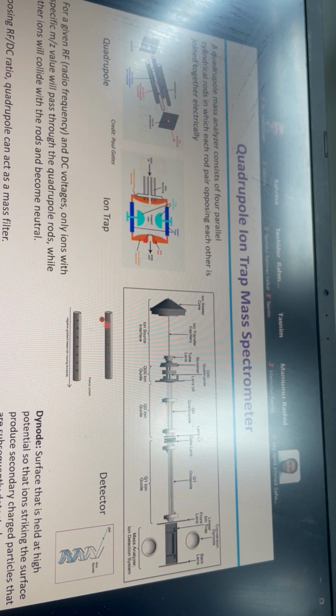It will neutralize itself. So when the positive ion goes near the electrode, we turn the negative voltage to positive voltage, so the positive ion is repelled and stays in its specific lane, so that it can go and reach the detector. So that's what we do: alternate the voltage.